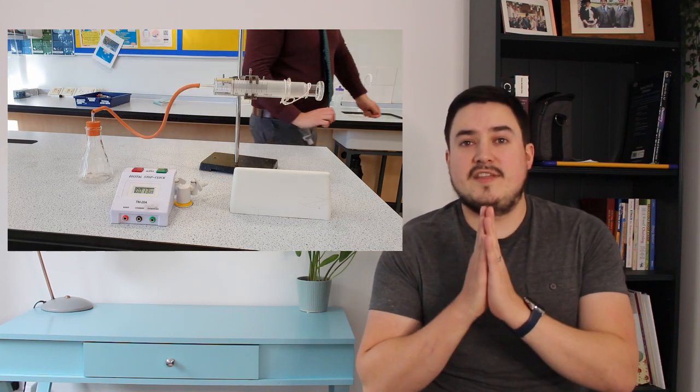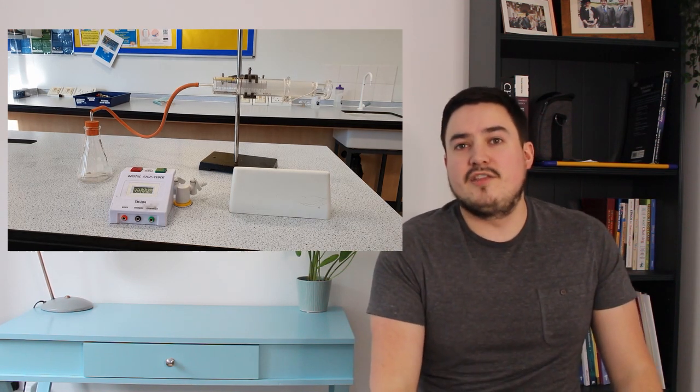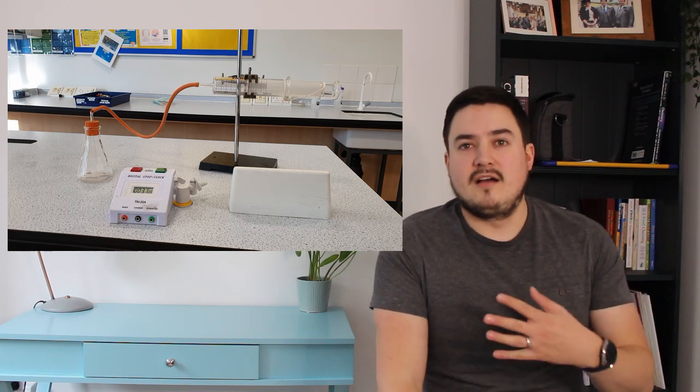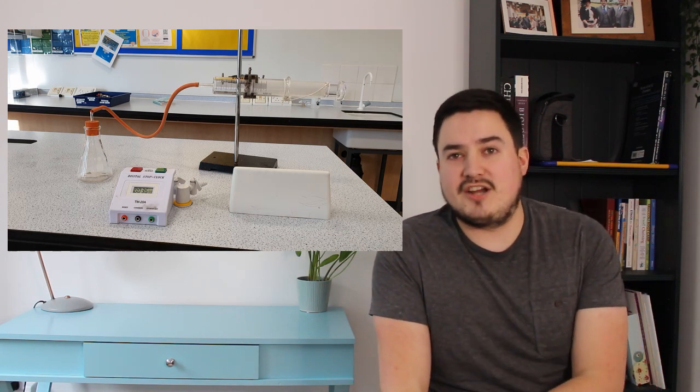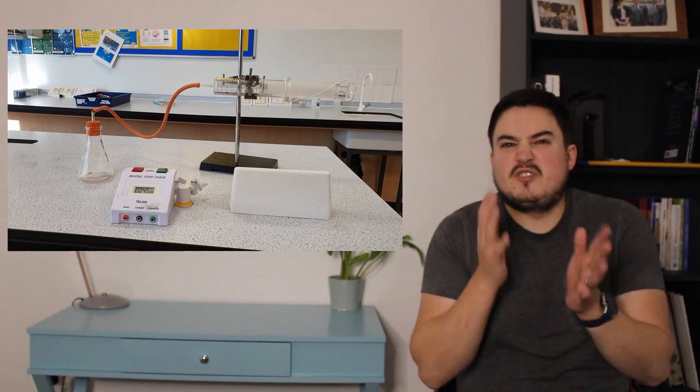As the gas is given off, the gas syringe fills up, and we start our timer as soon as we mix together the marble chips and the hydrochloric acid. We stop it when either we've gone over the end of the gas syringe or the reaction has finished, so no more gas is being released. And I'll write down the volume every sort of 10 seconds.